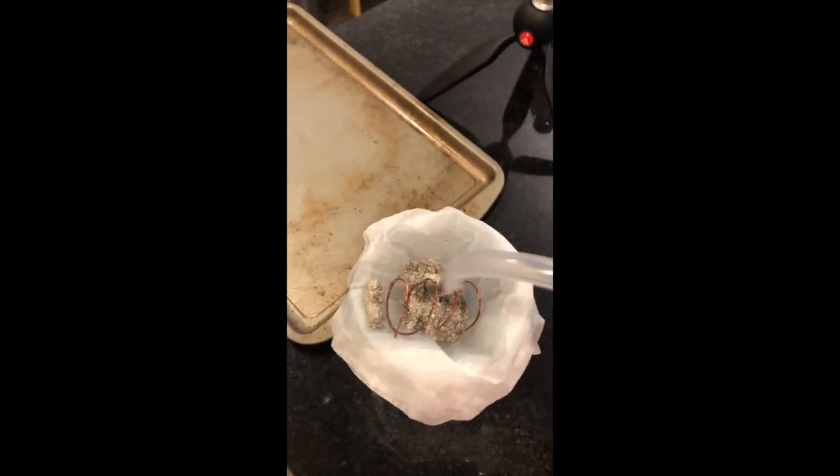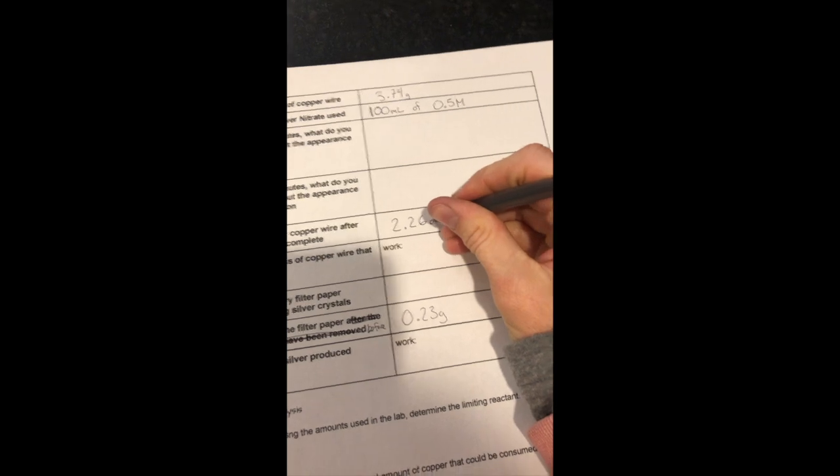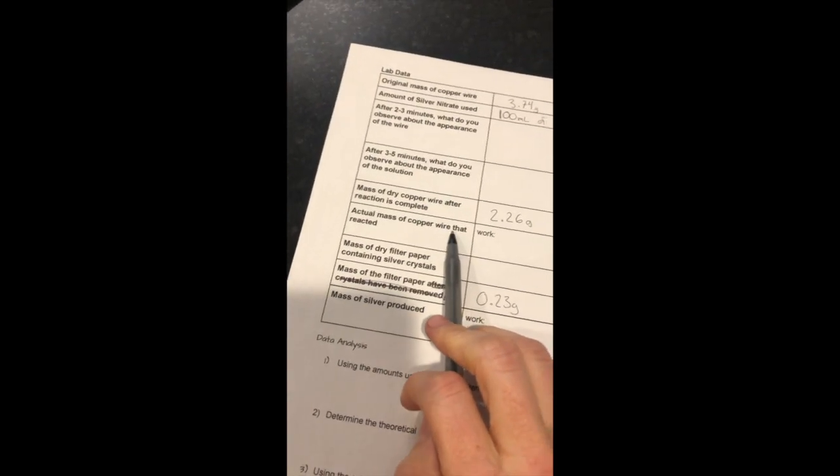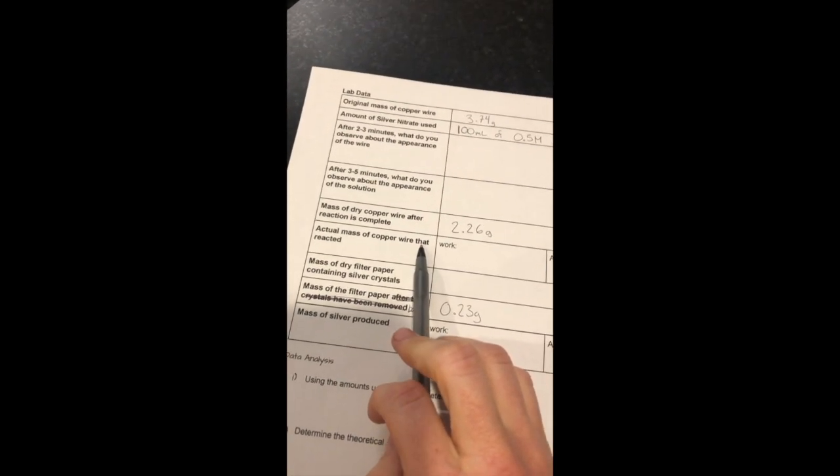So let's take our copper wire and get a mass for it. Okay, so the mass of our copper wire, there it is, was 2.26 grams. So if we want to find out how much of the copper wire reacted, it started out as 3.74 minus our 2.26 to find how much did react.